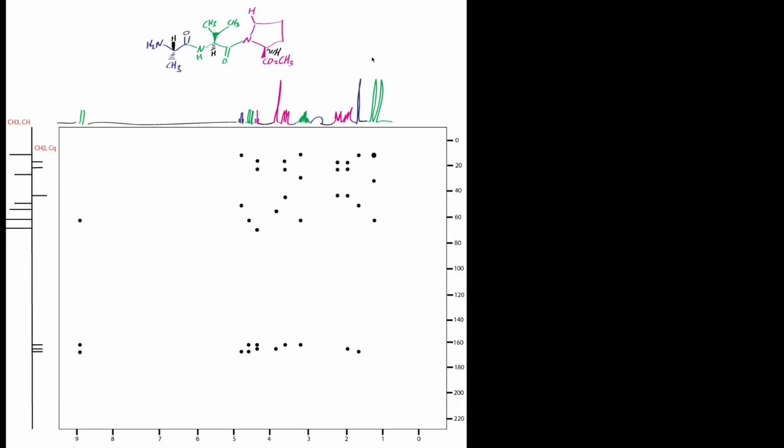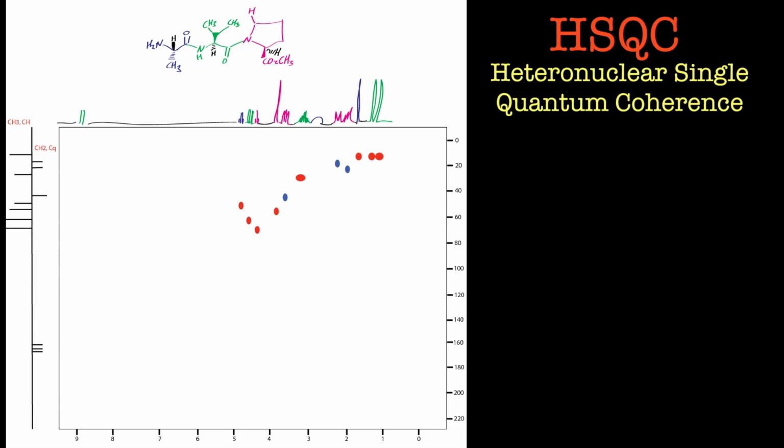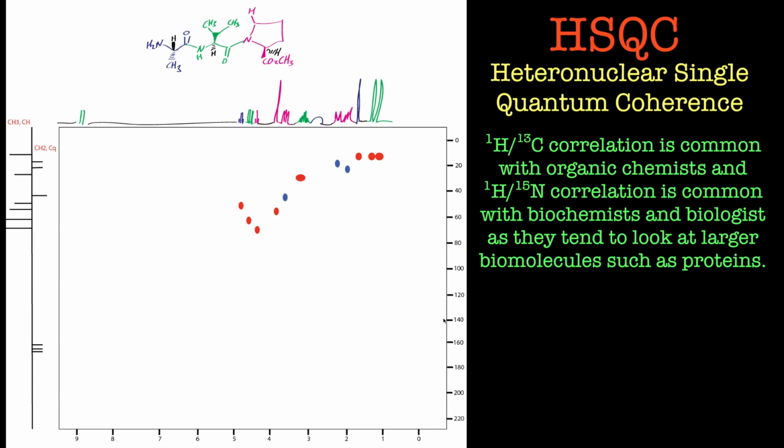Hi and welcome to this tutorial on HMBC NMR spectroscopy. The spectroscopy we looked at previously has been something along the lines of this, where we've got a DEPT-edited HSQC. The DEPT-edited HSQC relies solely on there being a proton attached to a carbon, so it's a single bond correlation. If there's no proton attached, for example the carbonyls here, then you won't actually see any signal in the 2D spectrum.